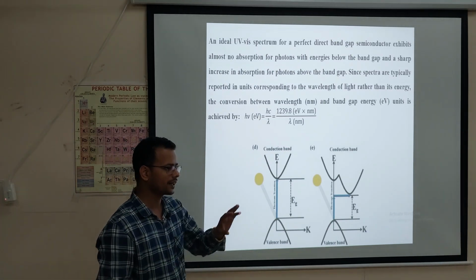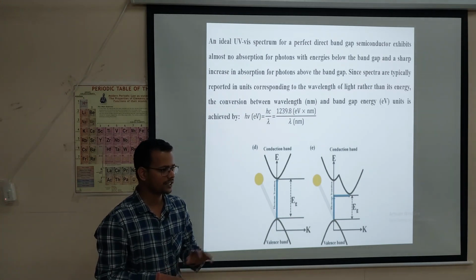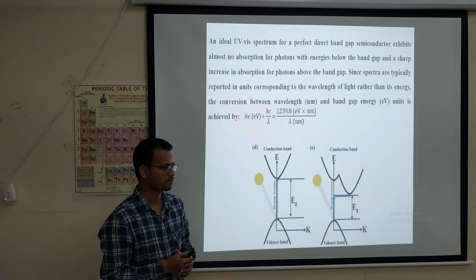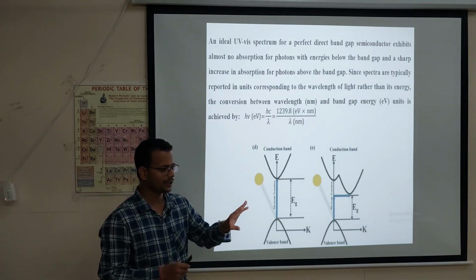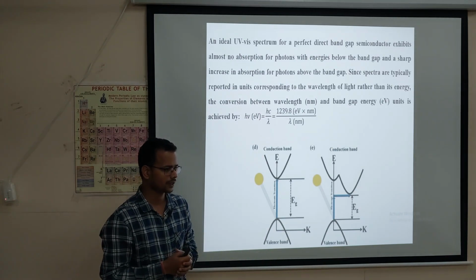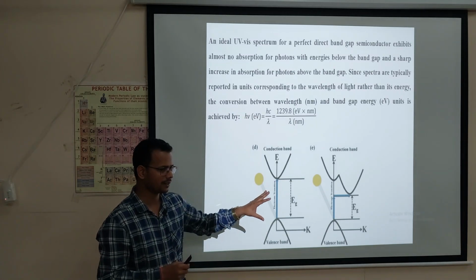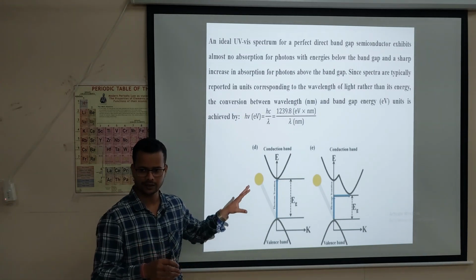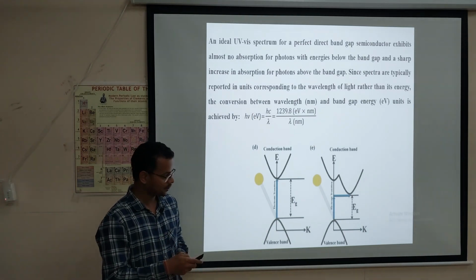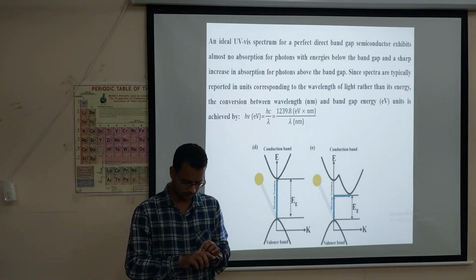After getting the band gap, there is a formula, which I will tell you later. By putting that in, we can get the direct band gap and indirect band gap. I have not given all these things here, because that will be very broad. If I add that here, it will be very broad, but I will explain everything here. Just tell us what is the use of direct band gap and indirect band gap.